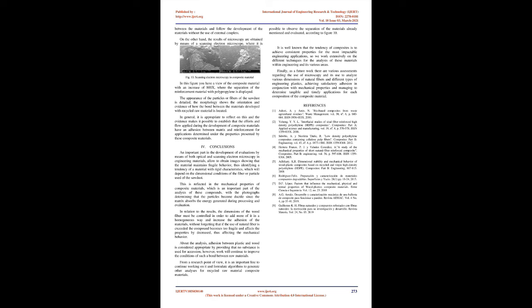It is well known that the tendency of composites is to achieve consistent properties for the most impactful engineering applications, so we work extensively on the different techniques for the analysis of these materials within engineering and its various areas. Finally, as future work, there are various assessments regarding the use of microscopy and its use to analyze various dimensions of natural fibers and different types of engineering plastics, achieving satisfactory adhesion in conjunction with mechanical properties and managing to determine tangible and timely applications for each composition of the composite material.